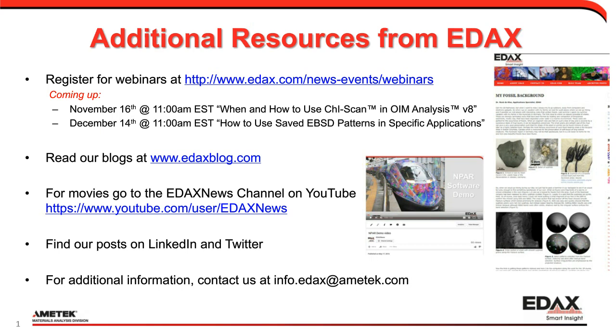And does the higher pressure affect the EDS detector? Great question. The silicon nitride window is very inert to any of the gases or humidity that you would have inside of the microscope environment. Even the polymer window should be fine too, but the silicon nitride window is commonly used as a barrier layer in microelectronics. So that's going to be your surest chance of integrity of the detector in those environments.